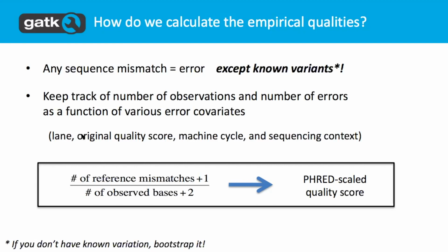However, some of the analysts in the group we work with sometimes use a database like COSMIC to mask out the most common recurring mutations they see in cancer, because some things do come up in the same places. So it is possible to mask that out, but in general, we see that it's not really worth doing. At worst, you get a little bit of extra noise in the model, but you can still detect systematic errors.